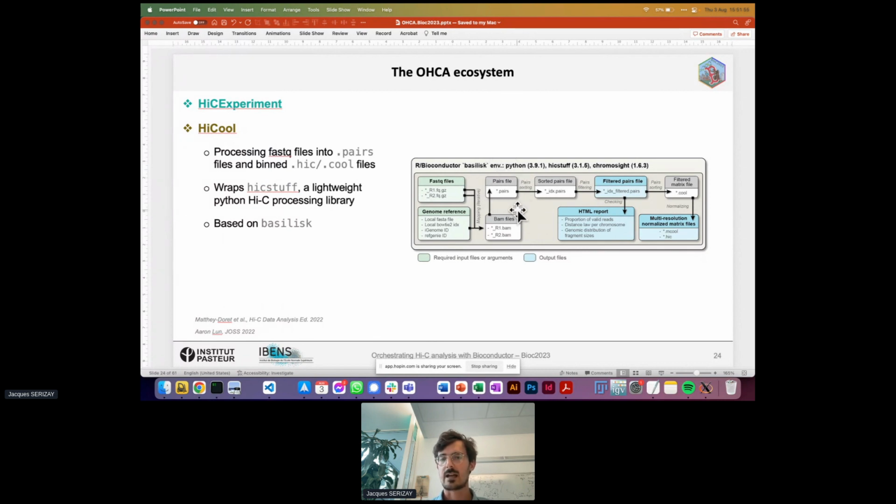And so at this step, to go back to the question from the chat, the eventual trimming of the reads is done internally under the hood, so you don't have to take care of the different options for the mapping of your data, but you do have a hand at some of the controls for this processing still.